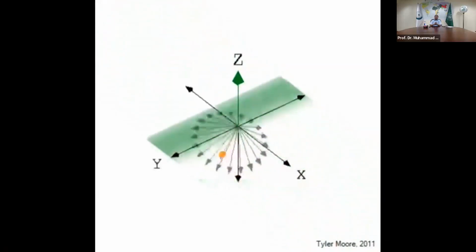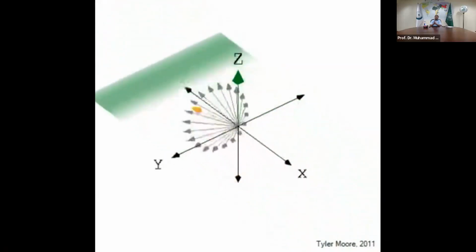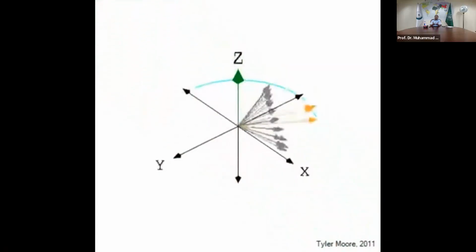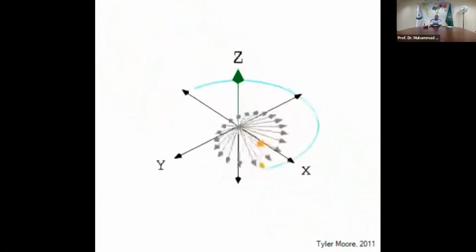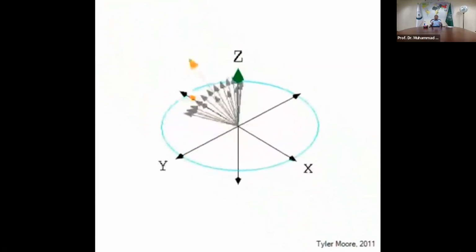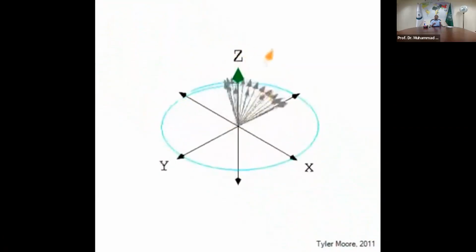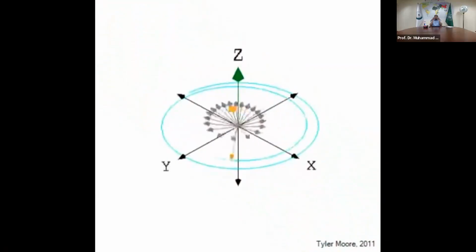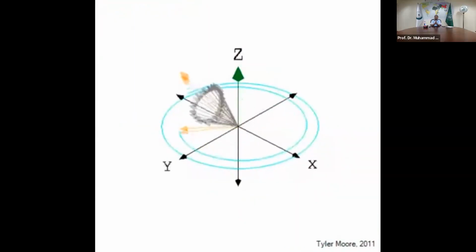As I said, about 63 or 64% of relaxation takes place through T1 relaxation, so it is an excellent method of measuring T1. The inversion recovery method is also an excellent method through which you can explain the utility and importance of the second pulse.